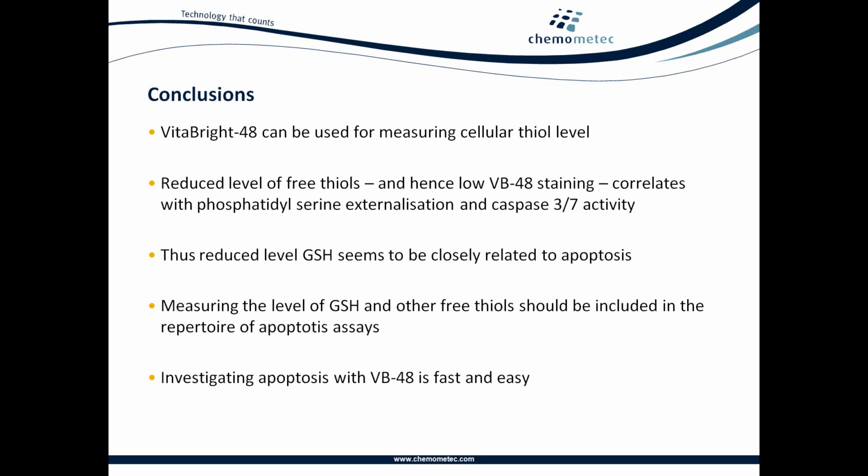Measurement of the GSH could then be included into a repertoire of apoptosis assays, mainly because it's very fast and easy. You simply mix a dye into your sample and measure.